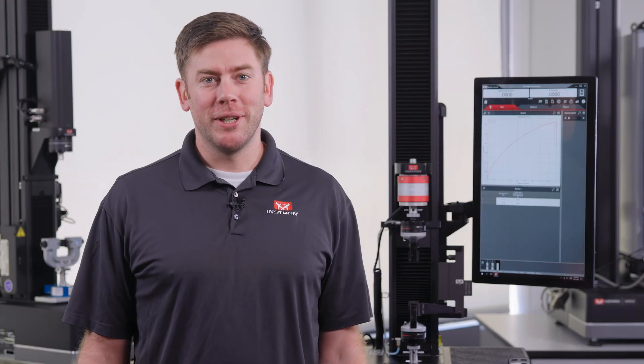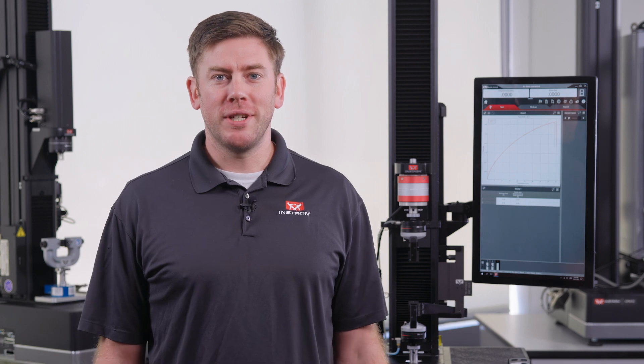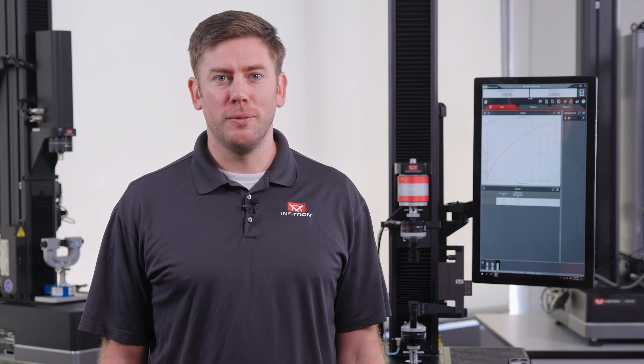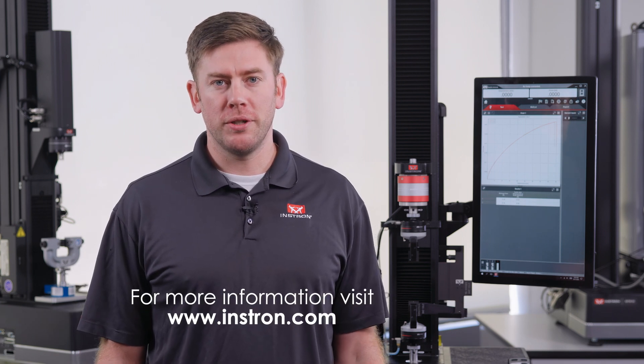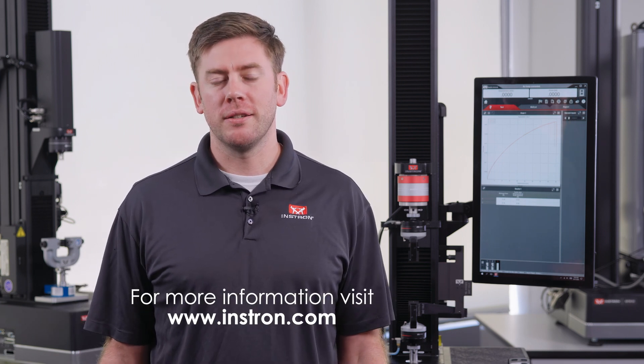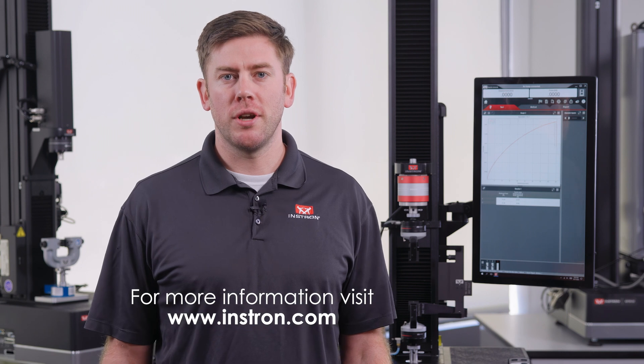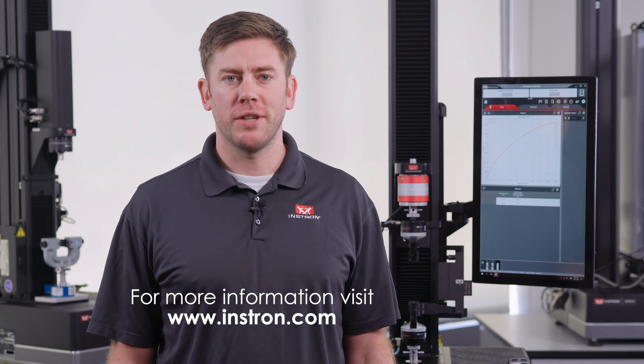And that's a quick look at how you can improve your testing of thin film and foil specimens. For more information or to contact us, please visit instron.com.